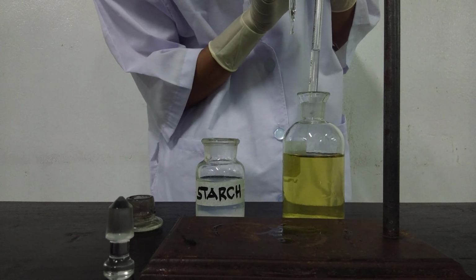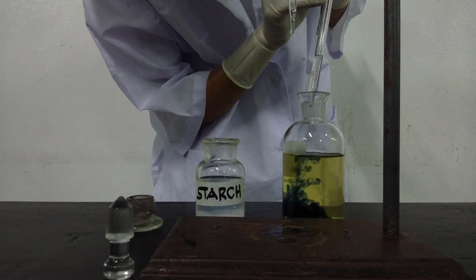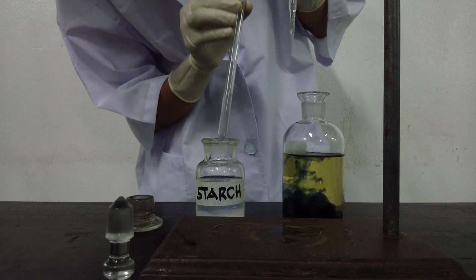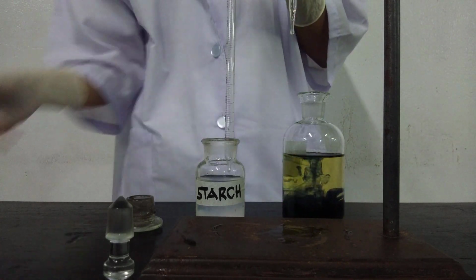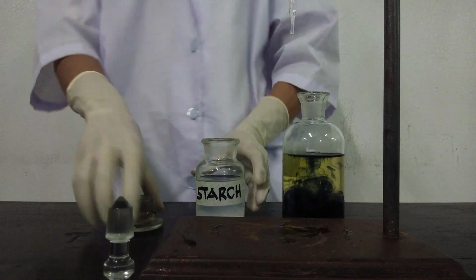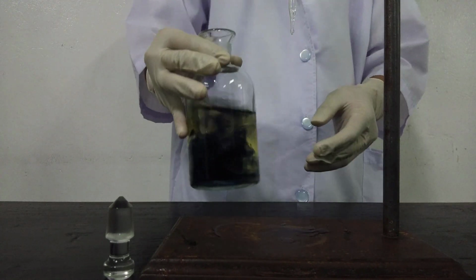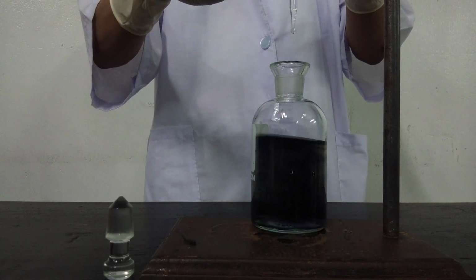Now in this video, we will see that after adding the starch solution, your water sample solution starts to become color blue. After setting aside your starch solution, we will continue with the titration process.